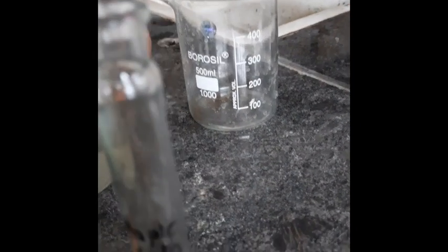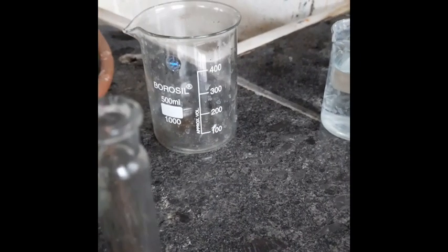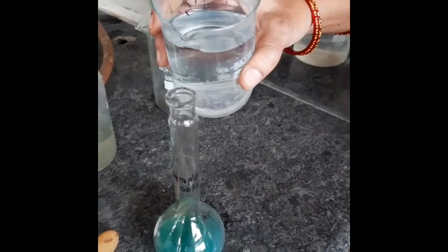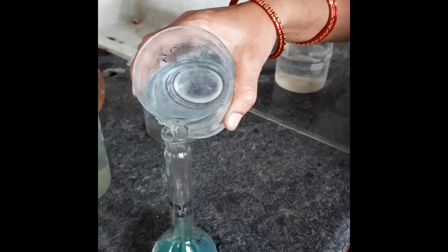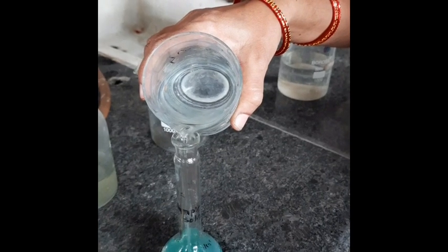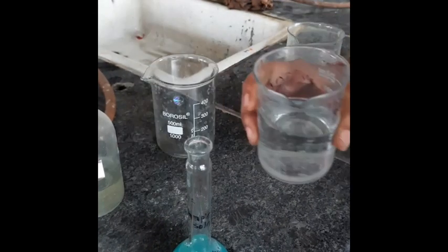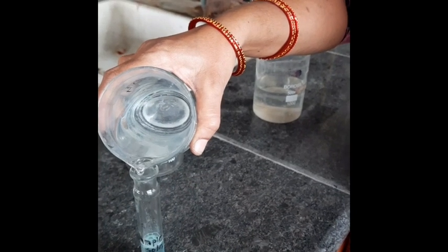Okay, you can see here there is one marking. This is the marking where it will be the 100 ml. So dilute this solution using the distilled water. Ma'am, please add the distilled water up to the mark. Yes, slowly, slowly. Yes.